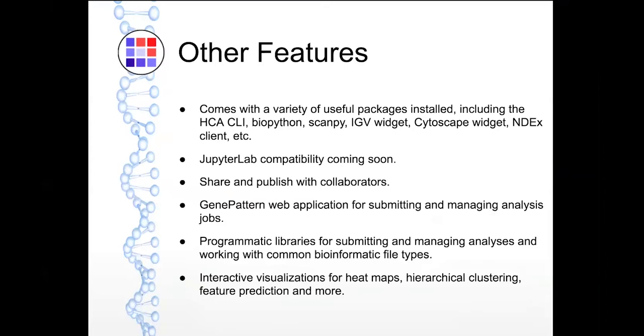It also supports R through the use of R cell magics. Compatibility with JupyterLab, which is the latest advanced Jupyter interface, is in the works. It will include real-time collaboration functionality. Through GenePattern, the workspace also supports a variety of interactive visualizations for hierarchical clustering, feature prediction, heat maps, and more.